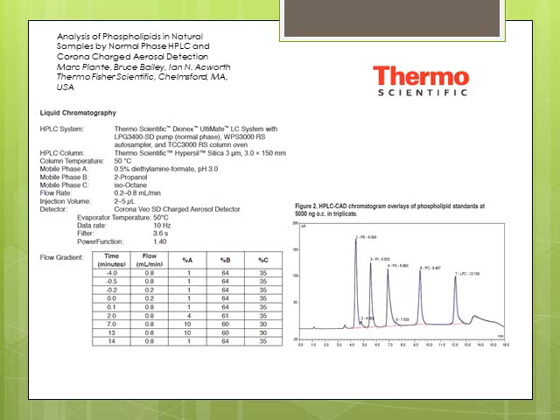Once again, I had mixed results with this chromatography. Because I'm not using exactly the Thermo Fisher conditions, my detector generated a lot of noise, and I could hardly see anything. So I did not get desirable chromatography with this method. Maybe if you have the Thermo Fisher equipment with the columns, and you exactly follow their method, you will get the chromatography that they are showing in this picture.